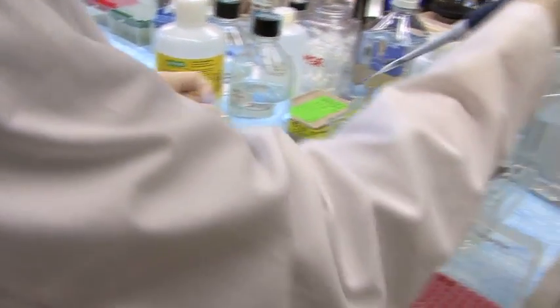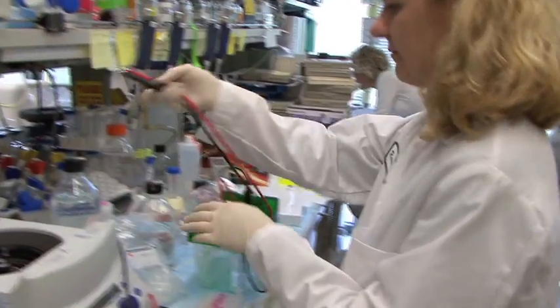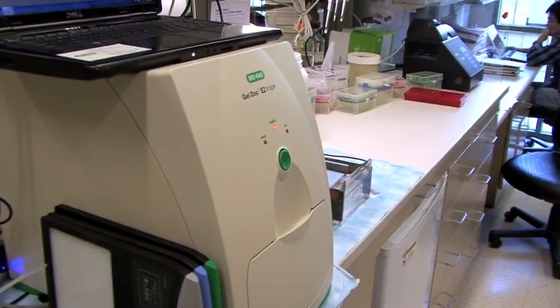So we are using it for DNA applications, for protein applications, protein gel applications, we are trying the stain-free system — basically we are trying to use it every way possible. The quality of the picture is really good.